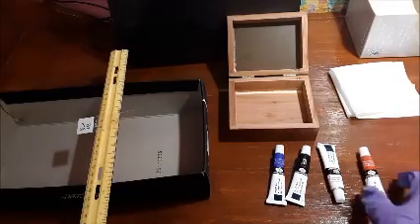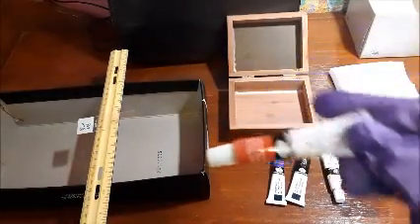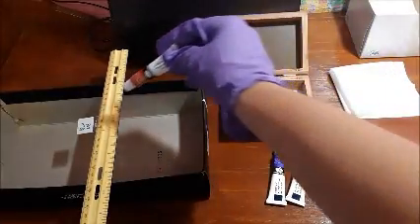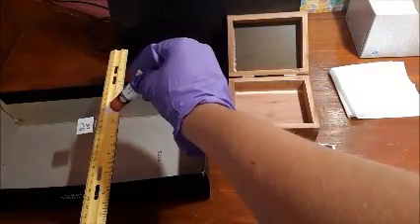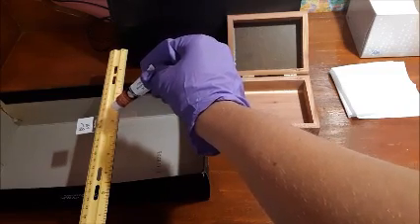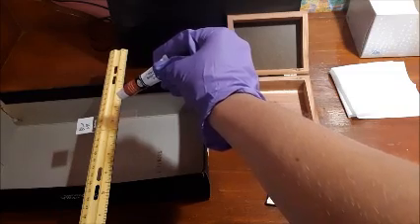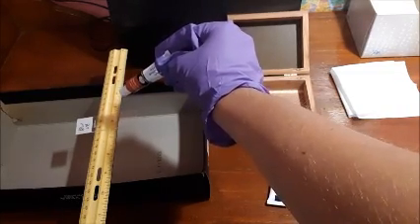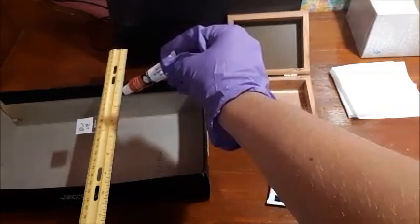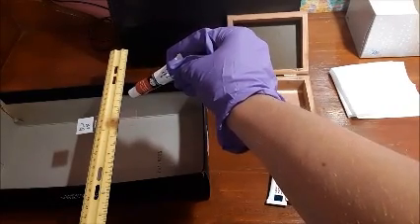The next and final stain that you'll be using for this part of the experiment is safranin. Now this you're going to apply to your smear for about 30 to 45 seconds. Now the safranin stain acts as your counter stain. Unlike the crystal violet stain, which turns gram-positive cells purple, this stain, safranin, turns gram-negative cells a pinkish reddish color.